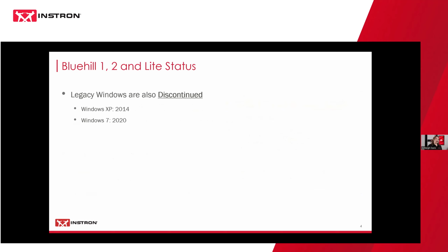and 1 and 2 and Lite dominantly run on XP and 7. We needed to create something that's compatible with Windows 10, I apologize, and Windows 11, which Bluehill Universal is compatible with. But Windows XP and Windows 7 were discontinued in 2014 and 2020, respectively.